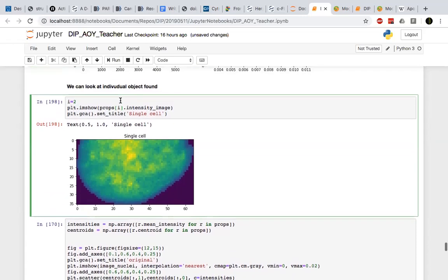Okay. Now you could think of methods that you can use this information. For instance, if you want to track cells, you can use cross-correlation between these little pictures as one of the measures of whether these two cells are the same cell, right? Or two objects are the same object. So you can think of that.